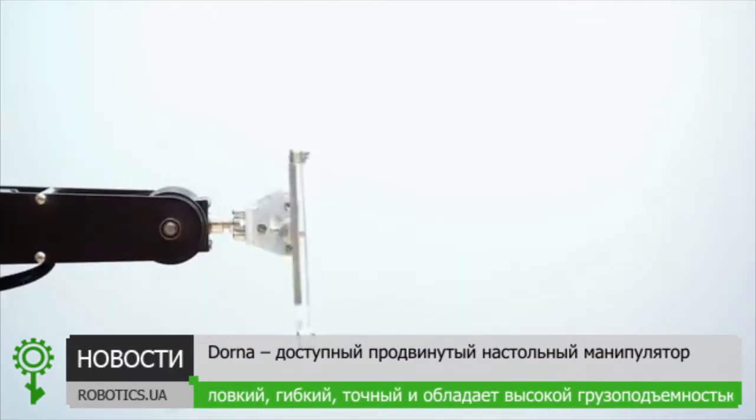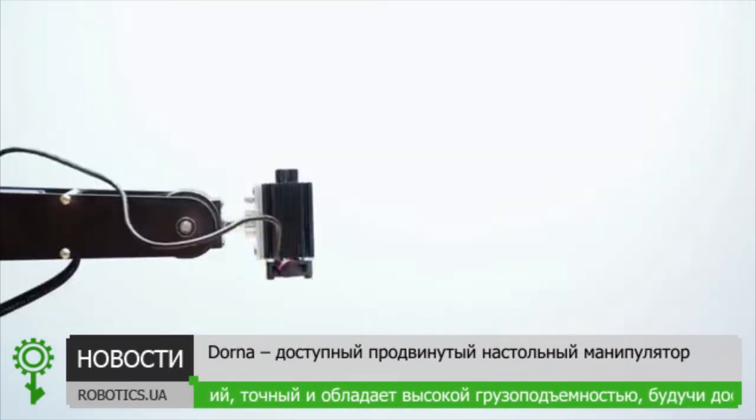Dorna is a versatile robotic arm. You can easily attach different tools through a simple shaft adapter.